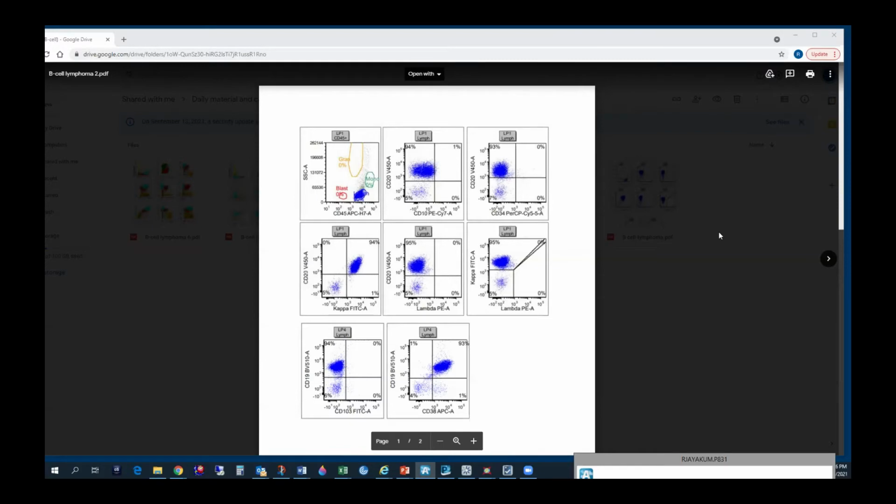For example, if you have an antigen that a T cell expresses, and a B cell is expressing that antigen brighter than the T cell, that's the normal for a T cell, so it will be called bright. It depends on a lot of things, and that's how they were defining things, but they never used any 20% cutoff ever. I was told that it gives a misconception sometimes when we use follow-ups.